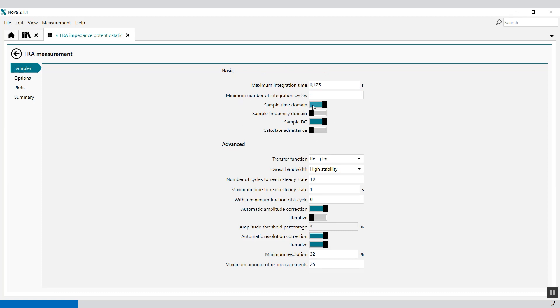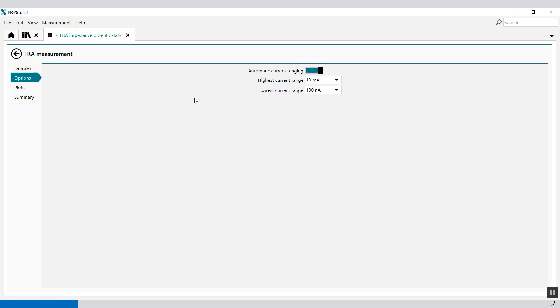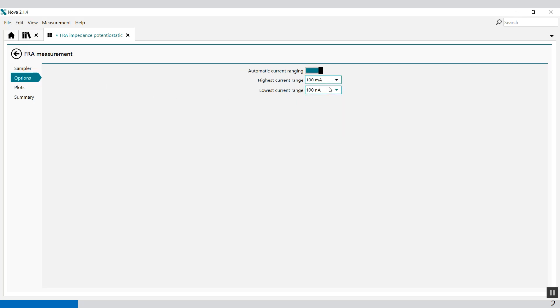I switched on the sample time domain. In the options you can select increase the current range. The highest current range is 100 mA and the lowest is 10 nA for this 204 instrument.